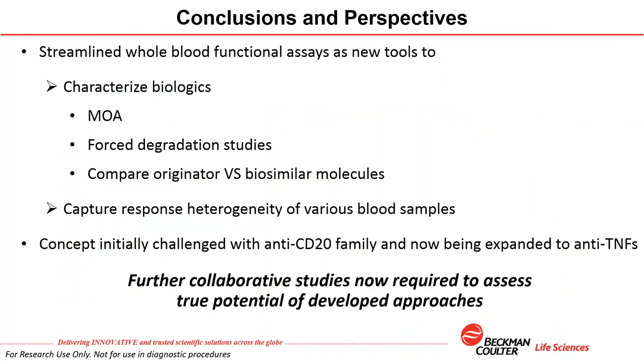This is bringing me to the conclusion. And what I wanted to show and what I hope I showed you is that we are able to develop highly streamlined whole blood functional assays that can be used to characterize biologics in detail. They can be used to characterize mechanisms of action of different molecules. They can be used to study molecules in the context of forced degradation studies. And we believe that they can be really interesting and important tools in the context of assessing comparability between a biosimilar candidate and an originator molecule. And also, and this is really the most important message of this webinar, maybe that this whole blood heterogeneity can be leveraged. And the question relating to the meaning of this heterogeneity will be the topic of further collaborative studies.